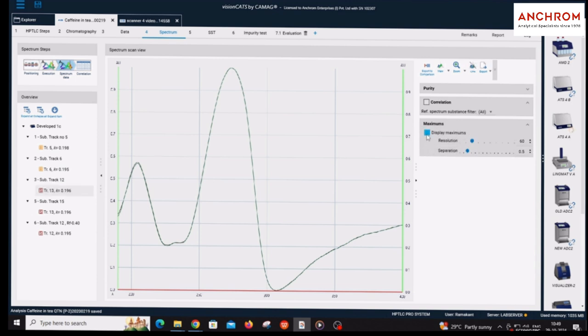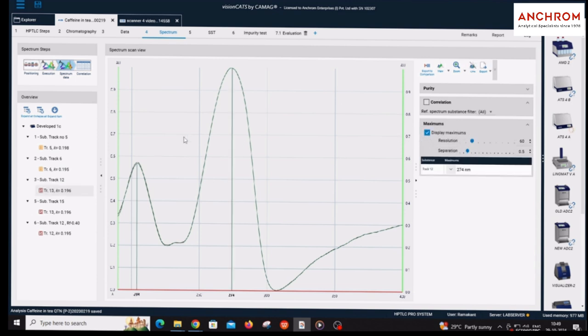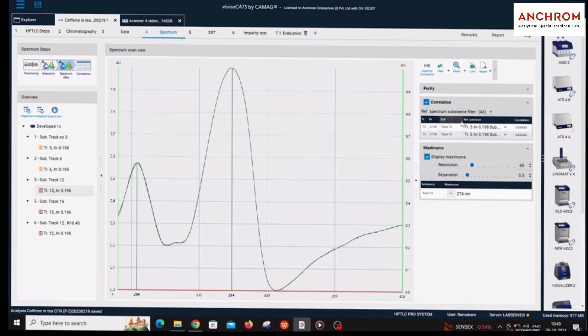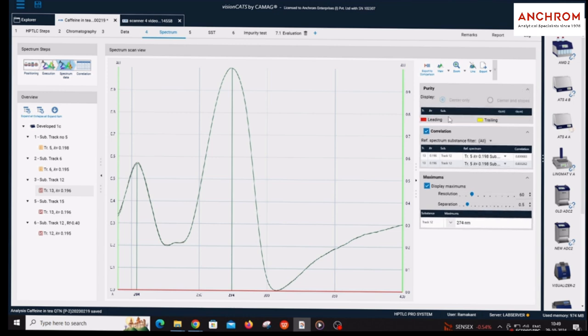Click on maximums option and select display maximum to check the lambda max. Click on correlation and check the correlation with the reference spectrum. To check the purity of the spectrum, click on the purity option. Check the purity of the spectrum at the center only or at center and slopes.